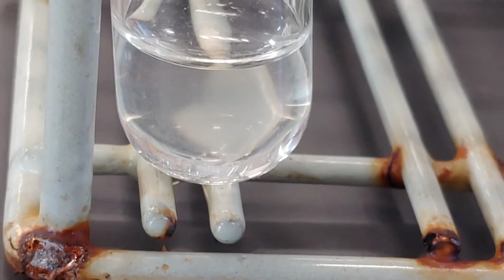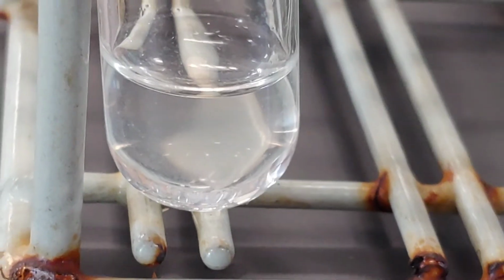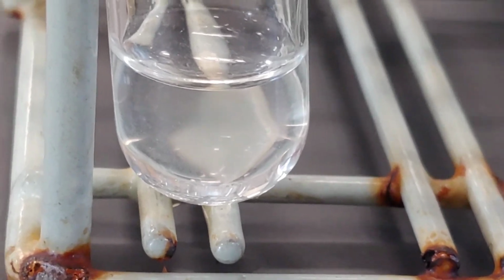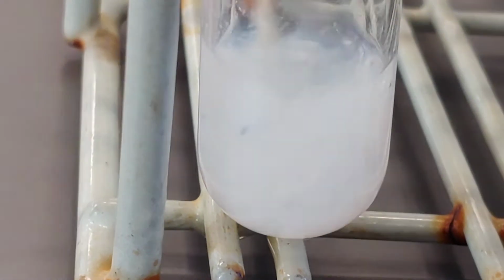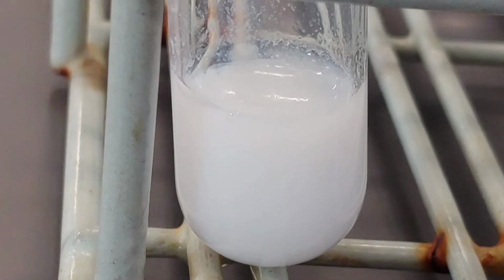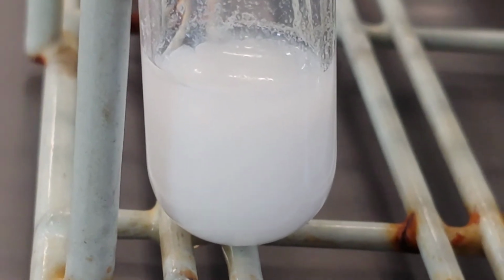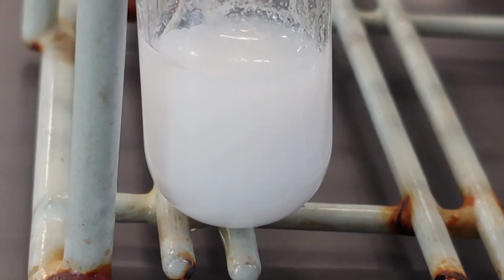Okay, now we're on to reaction number 8. This is aqueous potassium chloride. And to that, I am going to be adding some aqueous silver nitrate. Let's see what happens. Ooh. All right, there we go. Reaction number 8. Aqueous potassium chloride plus aqueous silver nitrate.